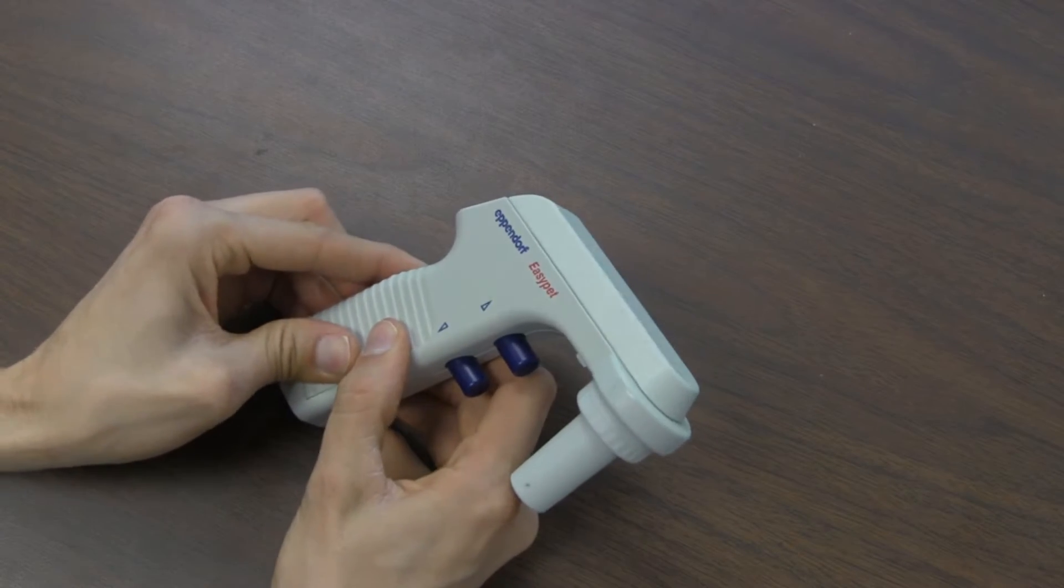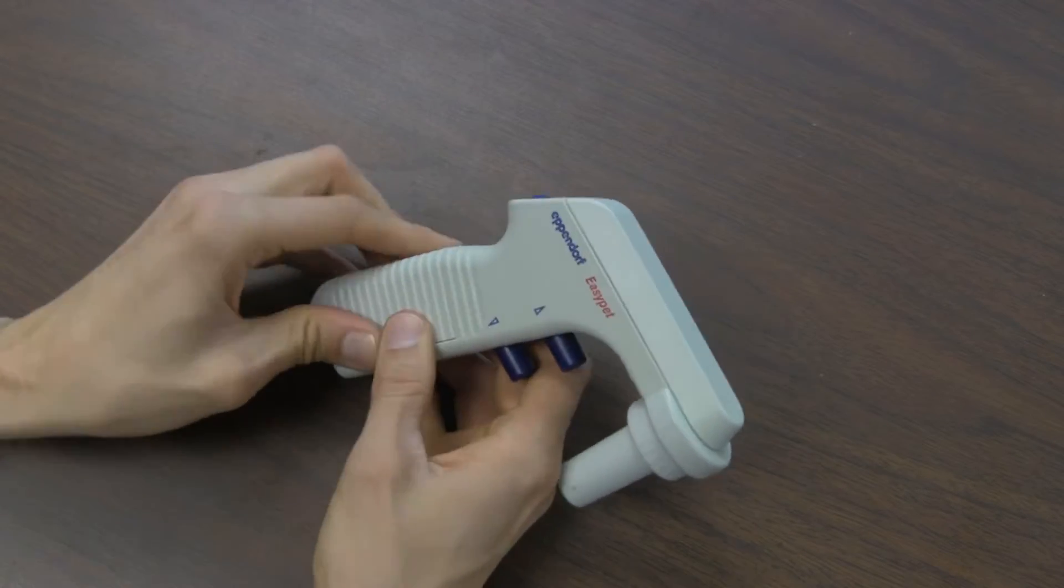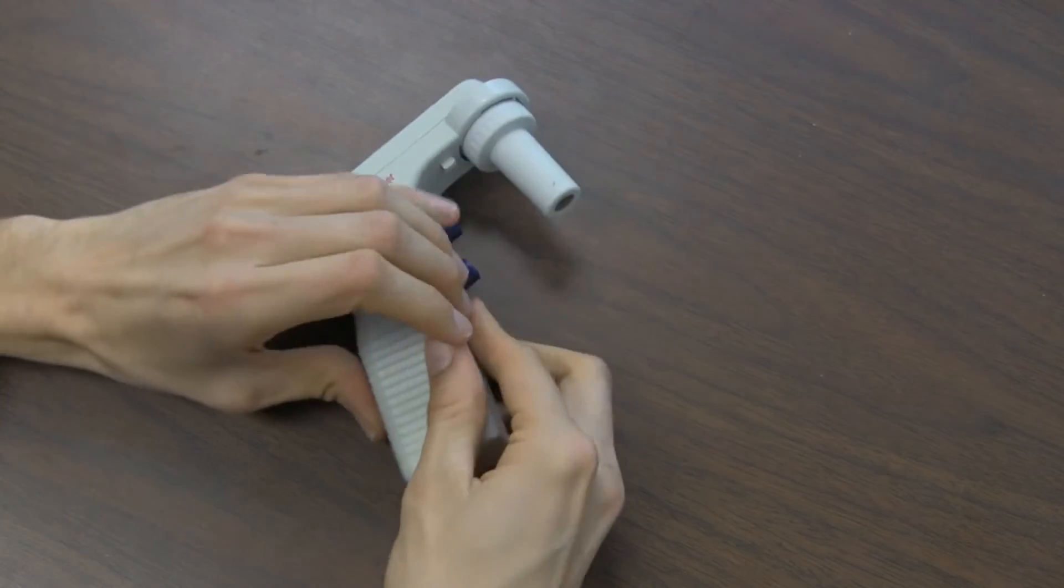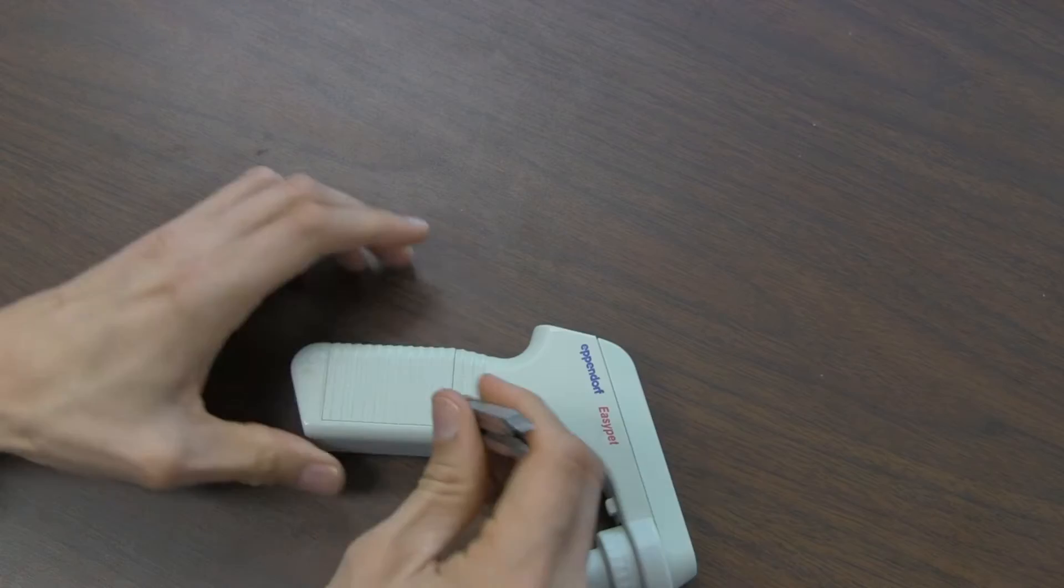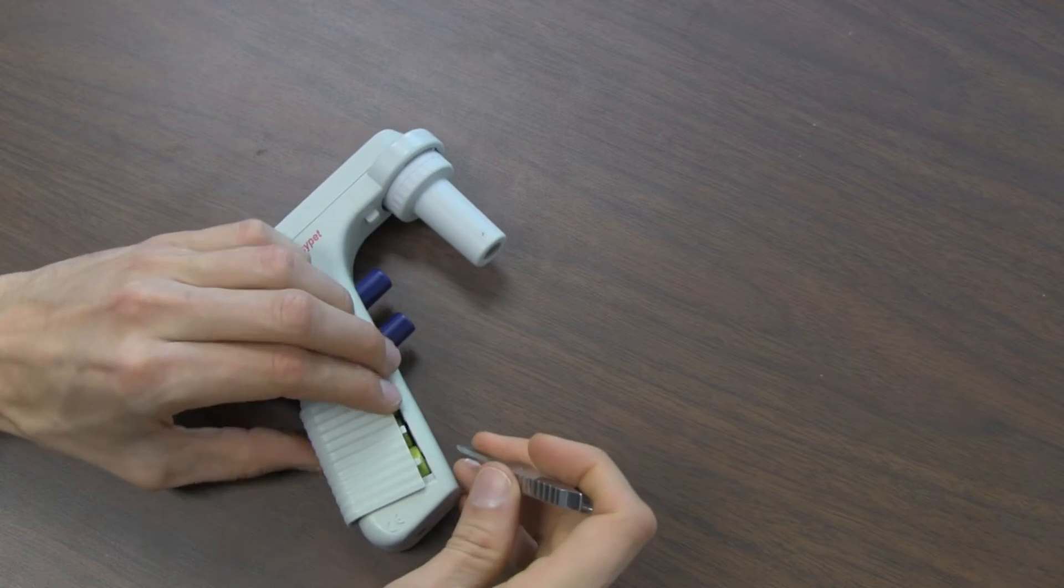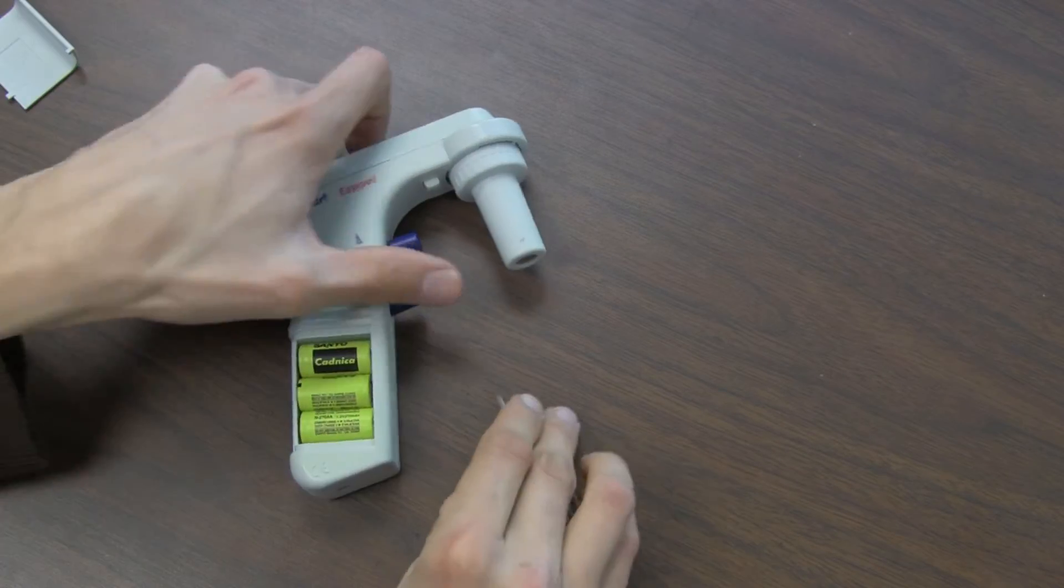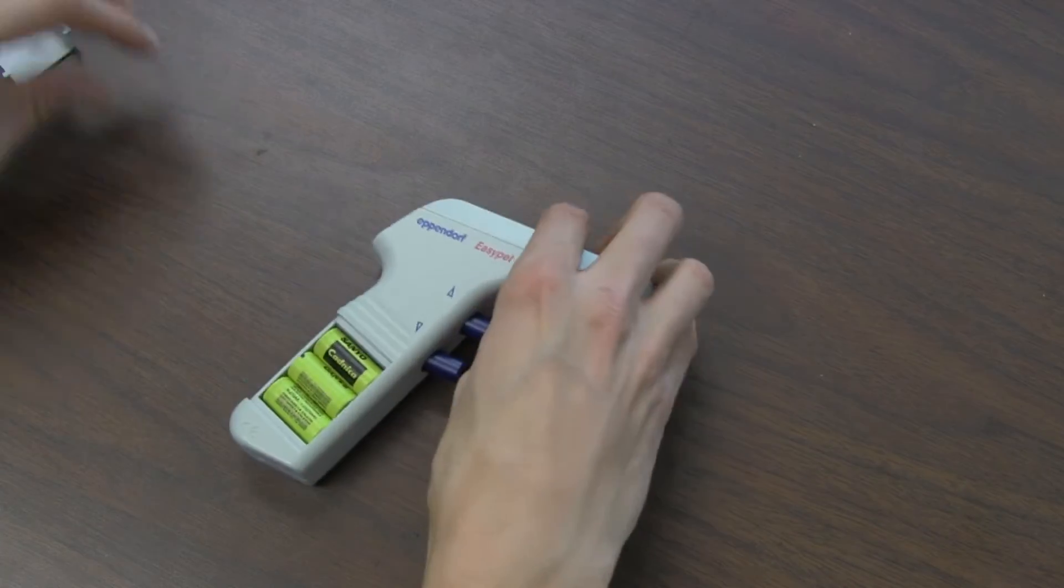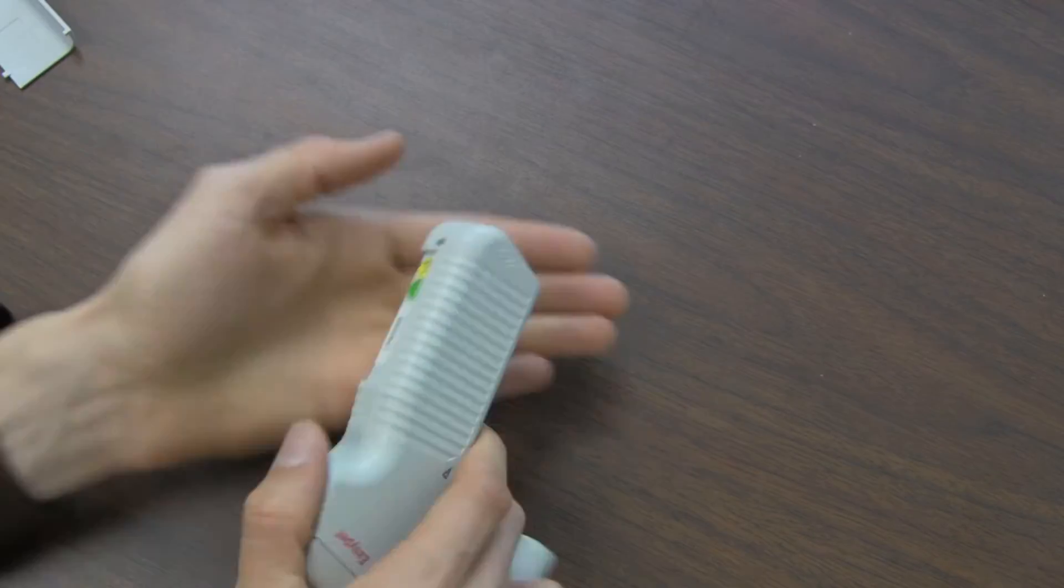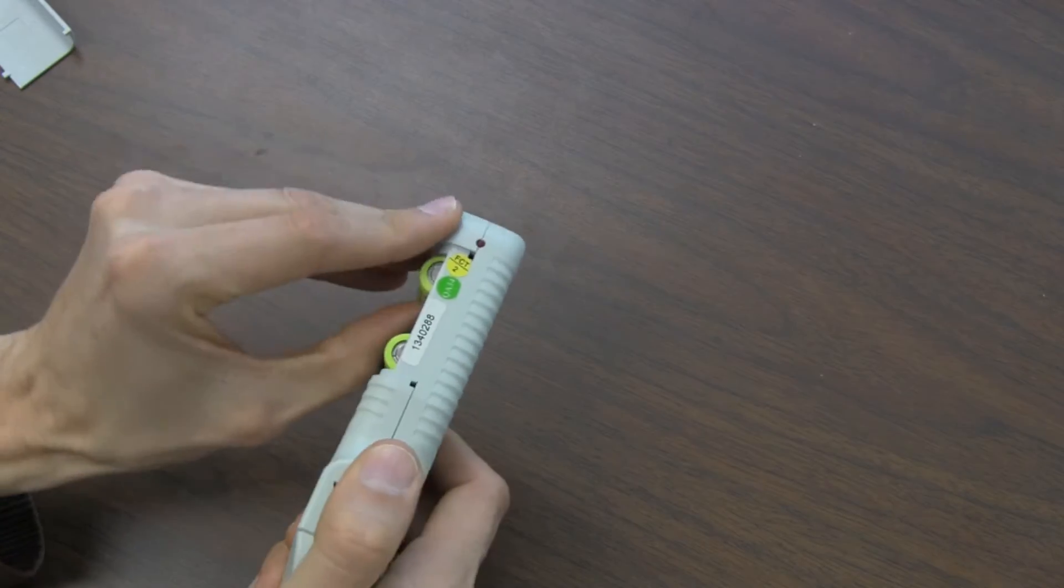First step to fixing a broken Eppendorf EZ-PET is to remove the battery compartment, which is not always as easy as it appears. You can use a screwdriver to help pry open the battery compartment because it's pretty hard to take off with your hands. Then these rechargeable batteries in here, the easiest way to get them out is to tap in your hand, get them out one at a time.